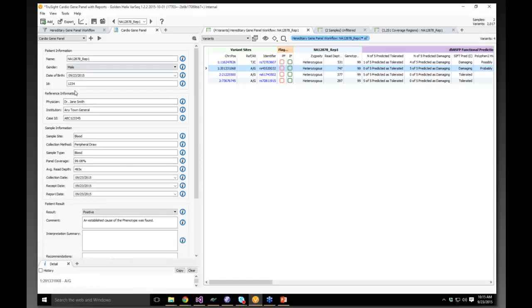And it pulls in information about the sample that you're currently looking at, and we can have a lot of this auto-filled in from things that are computed from the project, such as these target regions. These are actually the coverage regions, read depth and panel coverage that we just computed and we're just looking at for the sample. And you can even pull in some other information if you, on import or through VS Pipelines automation, applied extra field information to the sample level.